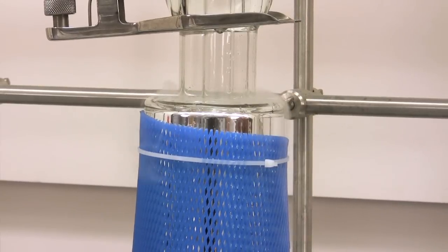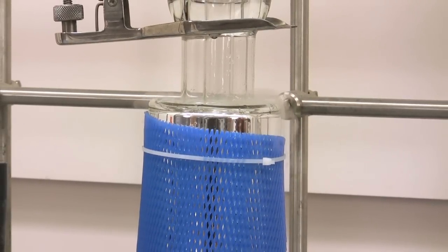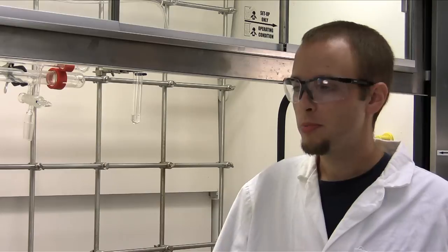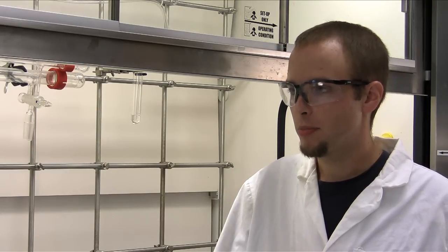We want to make sure that we're not condensing oxygen into the trap. What people forget is you need to remove the trap after you stop the pump and not let it sit. A mixture of organics and liquid oxygen is an explosion waiting to happen. Yeah, if you see blue liquid in the trap, it's a bad sign because it means you have liquid oxygen. Yep, and if you do see liquid oxygen, leave the room and let it evaporate. But, if you do things properly, you won't trap liquid oxygen.